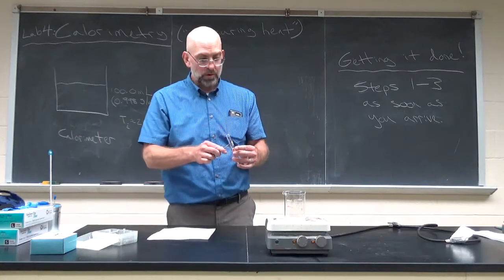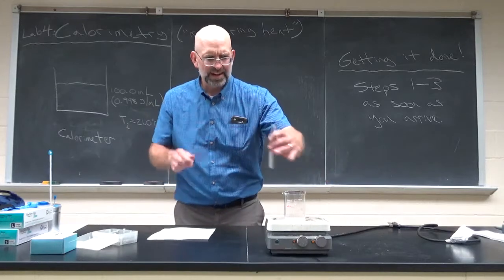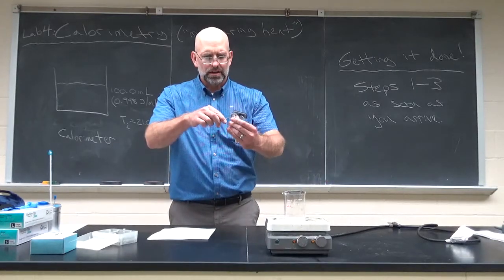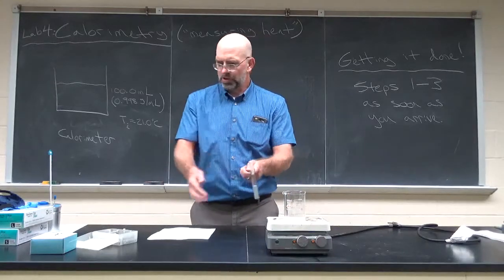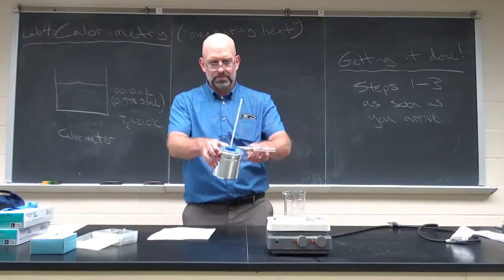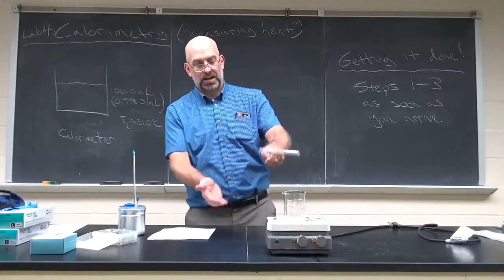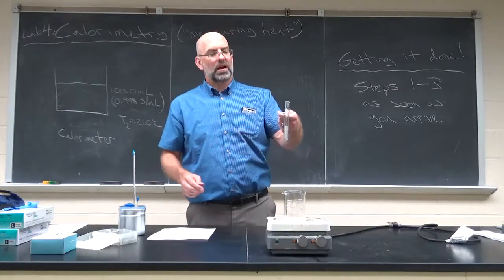And then place it in the boiling water. I think actually this goes fine. It's helpful here because you'll end up transferring this, and this may help. So when you have to put this into this container at some point, it's helpful if you kind of have it ready to go, so it pours out of there quickly.